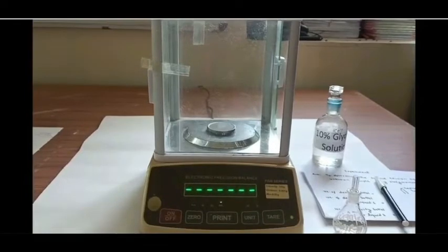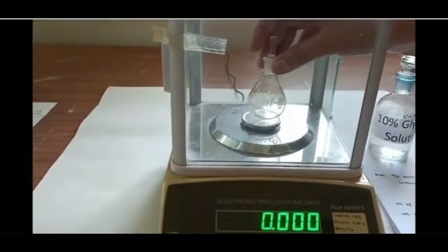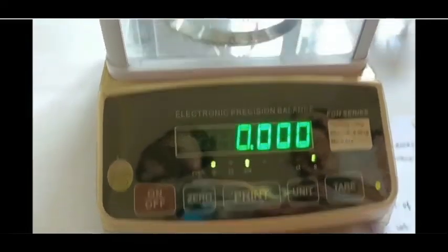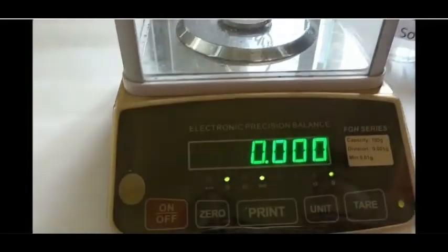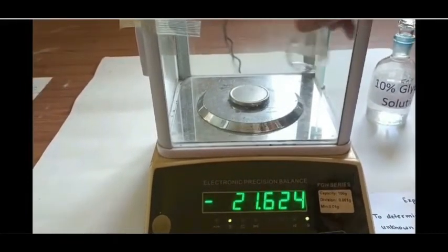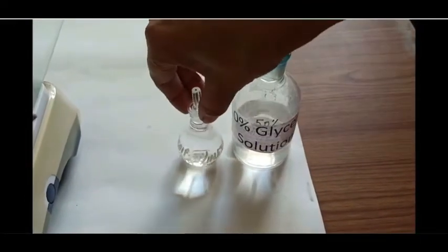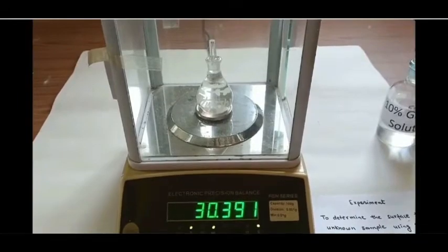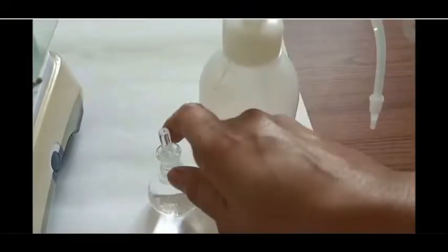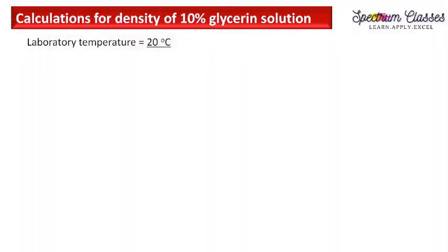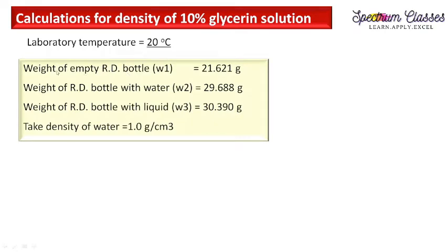Now let me show how to measure density. First I will weigh the density bottle — it reads 21 g, and I tare it so the subsequent weight will be the weight of the solution only. I will weigh the 10% glycerin solution. Note the laboratory temperature first. The weight of the glycerin solution reads 30.391 g. Now I will fill the density bottle with distilled water.